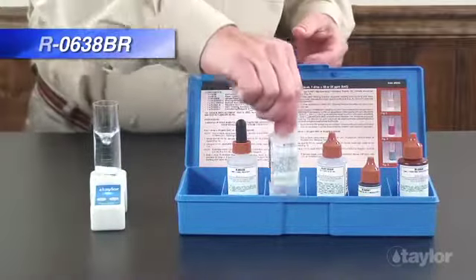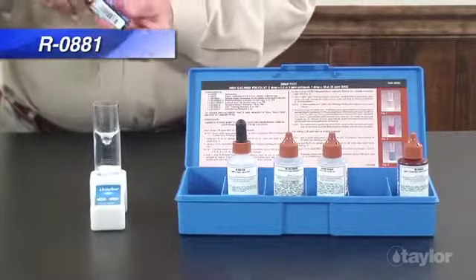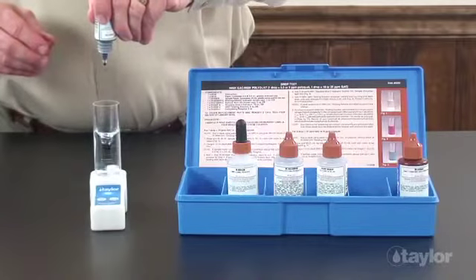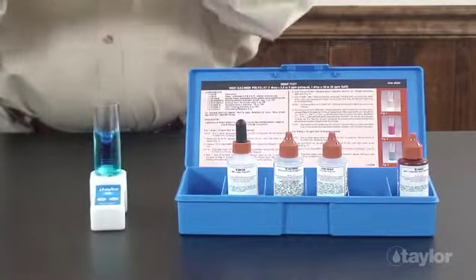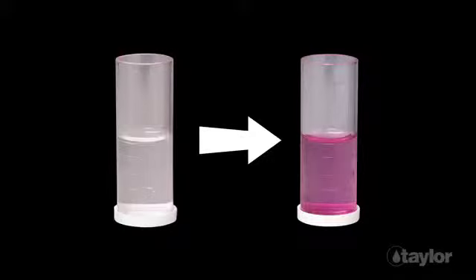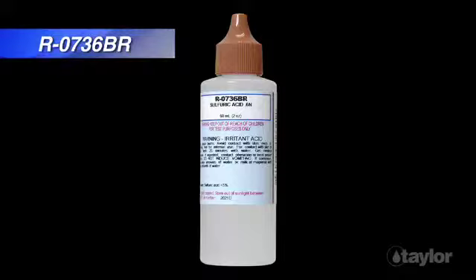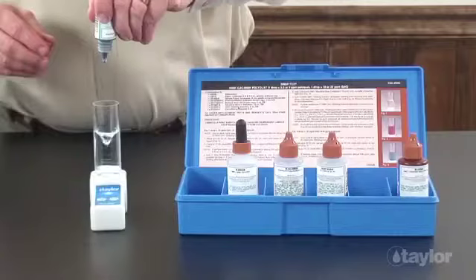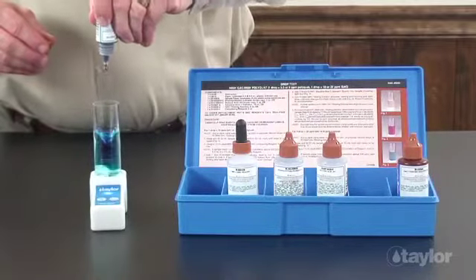Swirl to mix. If no color appears, add 3 drops of toluidine blue O indicator. Swirl to mix. Sample should turn a light blue. Note, if sample appears pink after adding the phenolphthalein indicator, add sulfuric acid 0.6 normal dropwise, swirling after each drop until the color changes from pink to colorless. Then add 3 drops of toluidine blue O indicator.